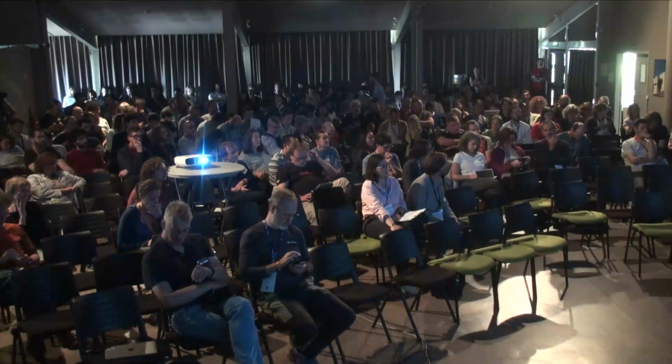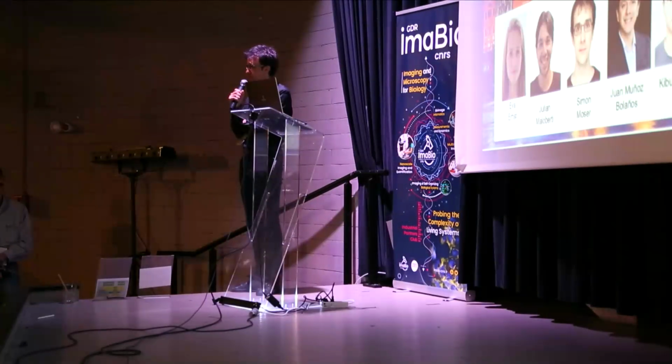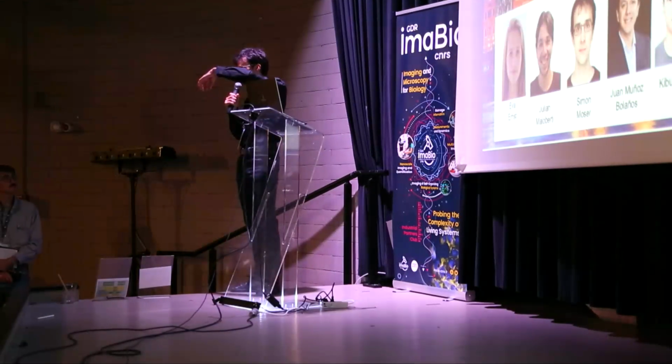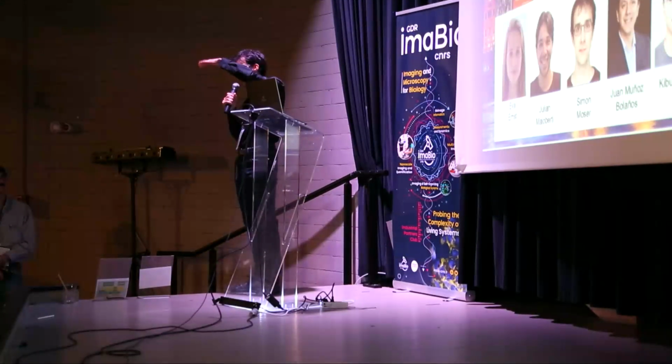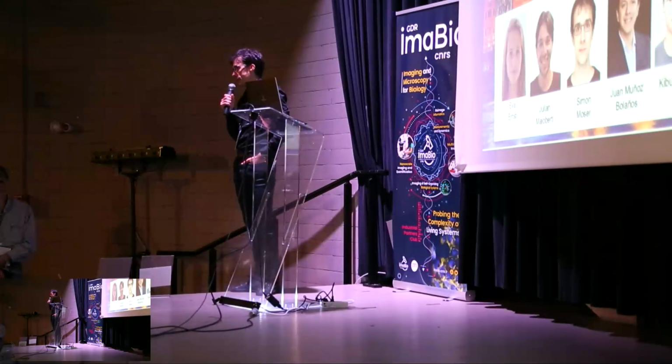Yes, that is totally correct. It's not at all in the back focal plane. But for this type of microscope, since it's a stage scanning system, it is totally irrelevant, right? Because the beam is always just going straight into my objective lens, and it doesn't really matter at all where the light modulator is. If I had a scanning system, of course it would be a different thing. But for that system, I think it is not an issue.